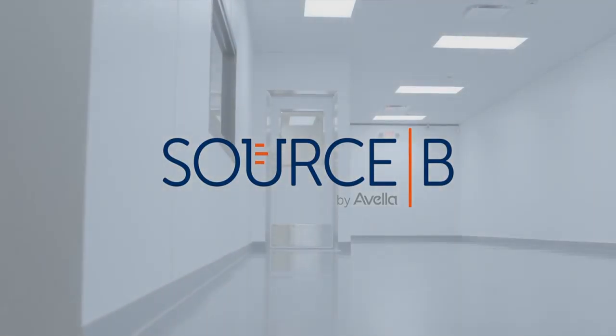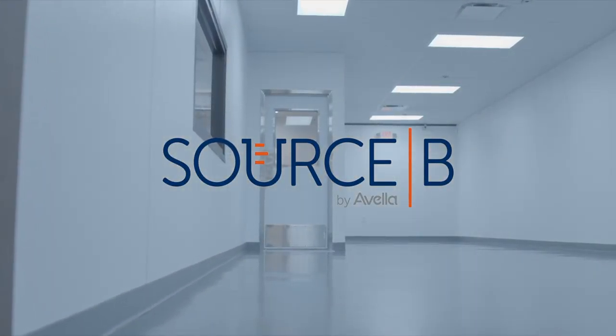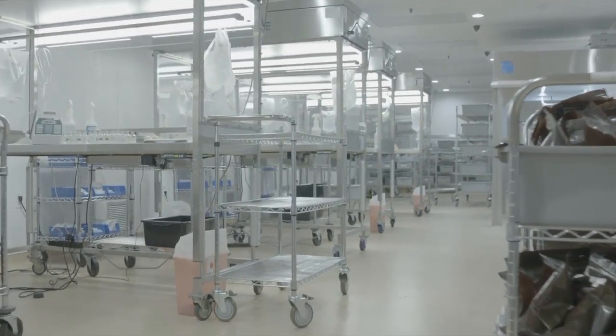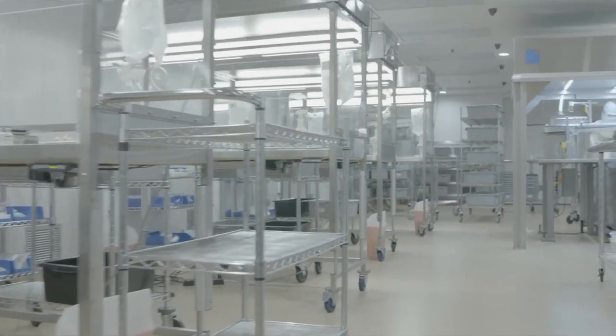SourceB, your source for the highest quality 503B preparations. Step inside our facilities to learn why Avella Specialty Pharmacy is the industry leader in compounding.